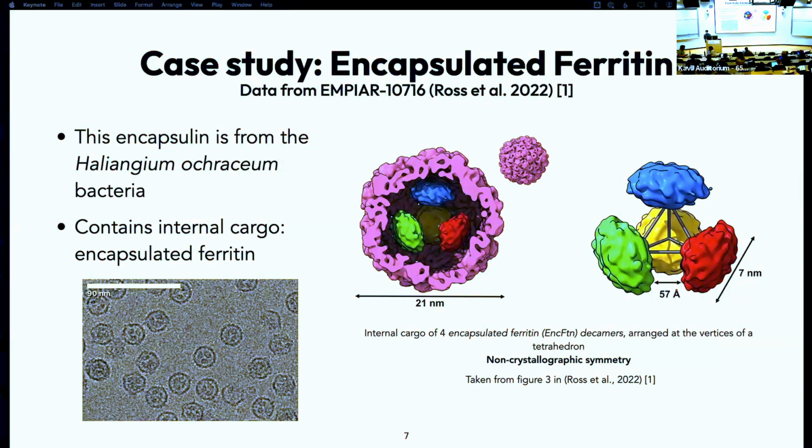A question from the Zoom people. How can you resolve small differences in amino acids? I have a heteromeric assembly of proteins which is almost similar in sequence, but only differs in 1 or 2 amino acids in one helix. The data was processed in C1 so as not to mask these small differences. However, these differences are not quite distinguished, even if the local resolution is 2.5 angstroms or better. What can you do? That's a very good question. That's a hard one. That's a very challenging problem.